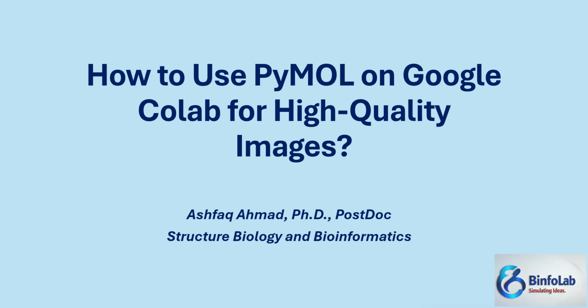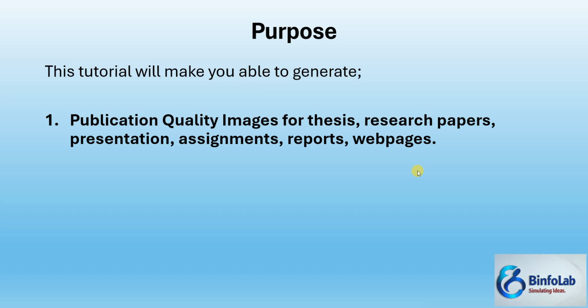Before this, I have covered several videos like how to work with PyMOL in offline setups and how to install PyMOL into your local computer. But I felt that most of you guys are unable to install or to work with PyMOL. So therefore, I brought this tutorial for you, that how you will be able to make good high quality images for your thesis, research, presentation, and other things without installing PyMOL.